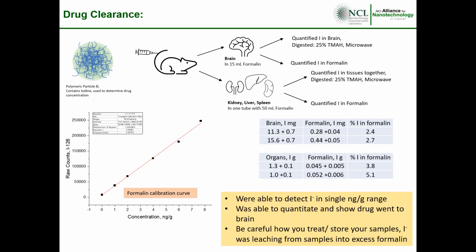And so we were concerned that because they were in so much liquid, we may be leaching out some of the nanomaterial and losing it into the formalin. And also with the clearance organs, we were concerned that if we are leaching these nanoparticles out, it could be commingling and giving us false results with some of these organs if there wasn't supposed to be any drug in them.